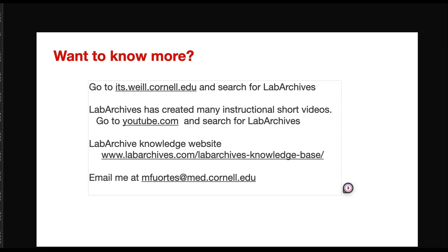Or we could take that very sensitive data set that may exist in RedCap, export it, and make it available in the wider resource that Michele was describing, and that's only for internal purposes. So those are things that we can figure out, but please continue using RedCap and LabArchives. Does that make sense?